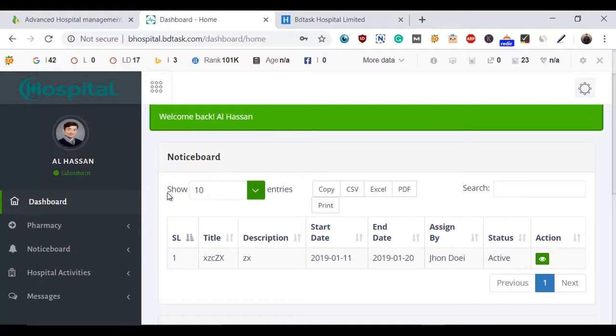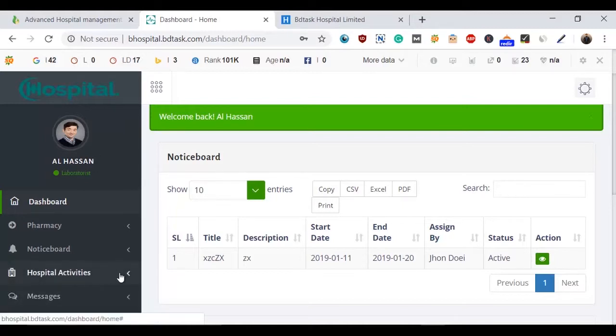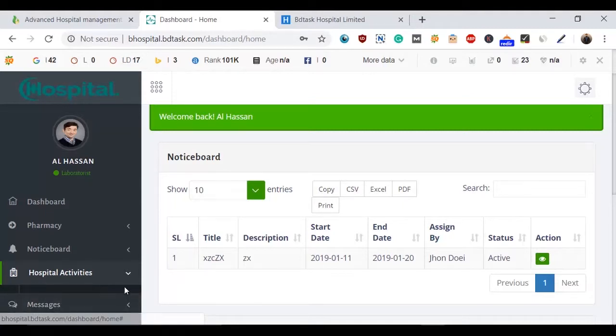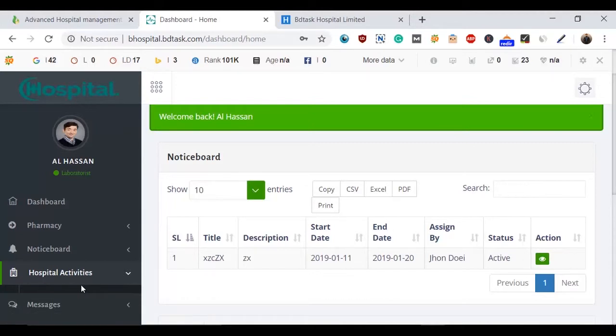They will see all the activities here. Currently there are no activities available because we haven't assigned any yet. You can assign hospital activities here. So this is all for the laboratorist's point of view.